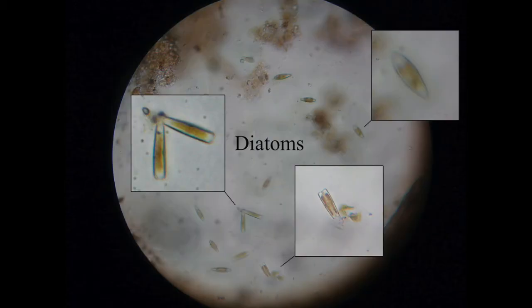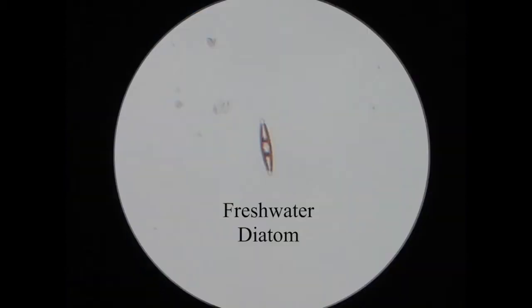Moving on to diatoms — these are really tiny little things and they look like they're made of glass because they are silica. You'll usually see these as having a sort of brownish tinge to them. You might have heard of diatoms in relation to marine life, but there are loads in pond life as well. This image shows three different species. Most of the ones you see could be described as grain-of-rice shaped, and they kind of move around with a steady forward motion.